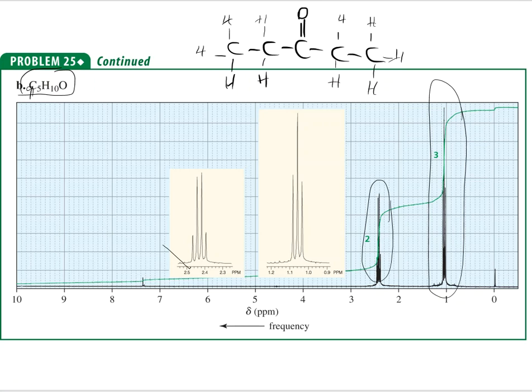That is a plausible structure. And then to make that even better, what we're seeing here is a very symmetrical molecule. I could almost cut that molecule in half, and the half to the left and the half to the right match up pretty well, which means that I can ding dong that one and ding dong that one and not worry about those over there because those were equivalent protons, and this leads me to 2 signals that I would see from that molecule. And it just so happens I see 2 chemical signals showing up on the NMR.